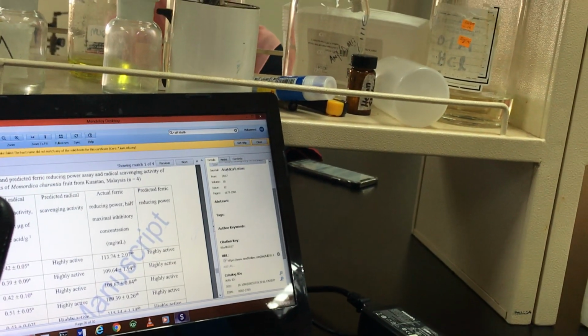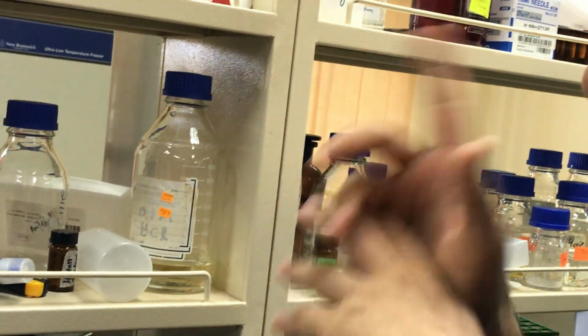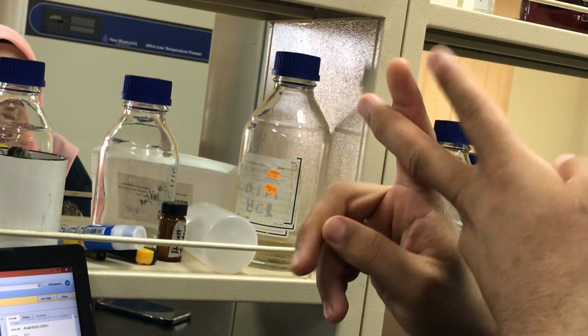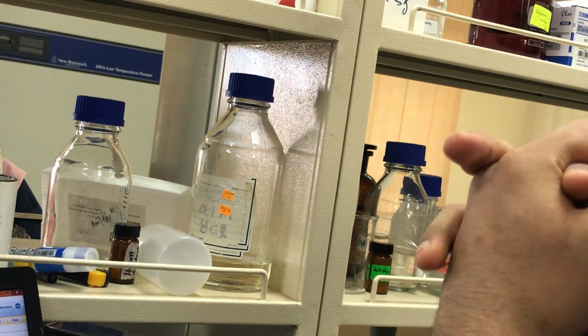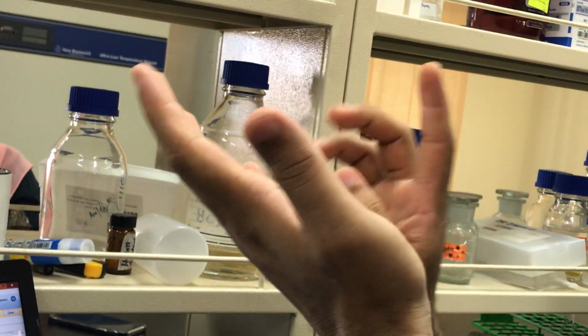I think last year we worked with different plants. I think the water extract was active, so water and 20%, 40% aren't showing activity. So maybe we can discuss about the plan. Yeah, I mean, because I will read the report, I just want to focus on that.